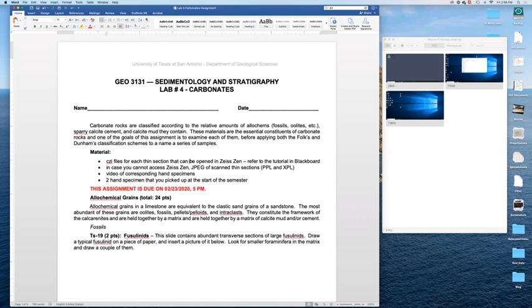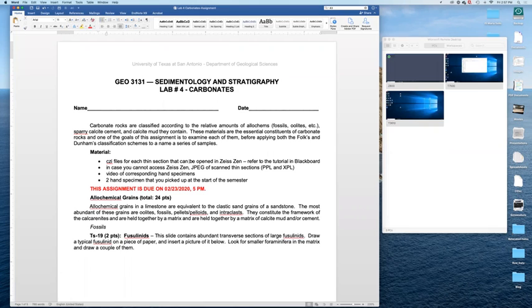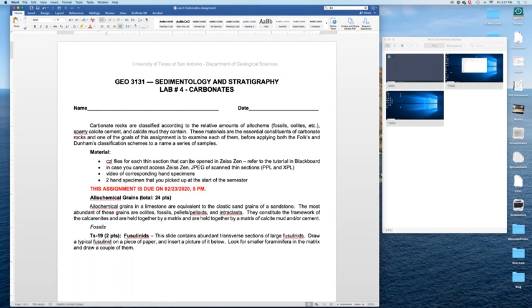Hello. This week we will be working on carbonate rocks. We will be looking at samples that correspond to either scanned thin sections or hand specimens. You actually have two hand specimens that you picked up from us at the start of the semester that you need to describe for this assignment.